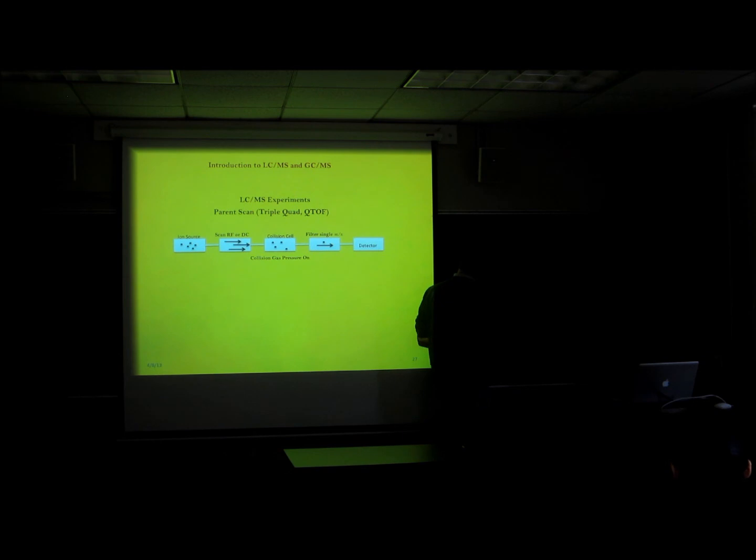You average the mass spectra underneath that specific chromatographic peak, and you get a number of peaks at different M over Z ratios or values. Let's say this mass to charge ratio is very interesting. It's 159. It's interesting only if the parent compound has a mass of 159.